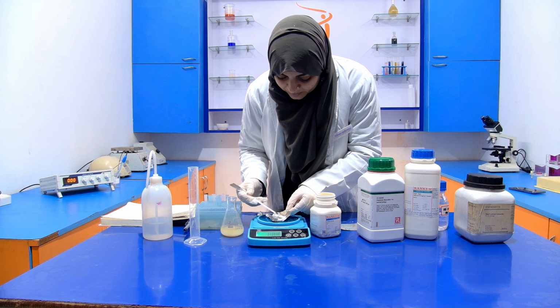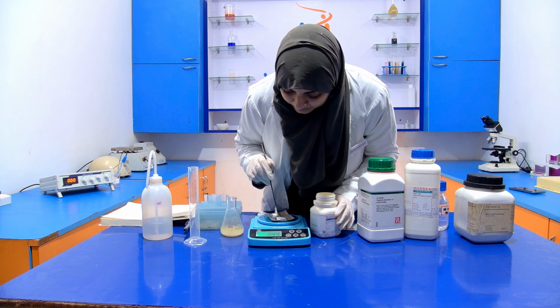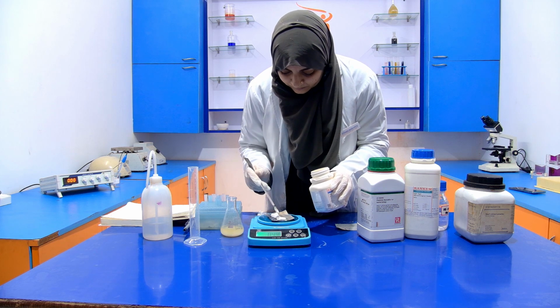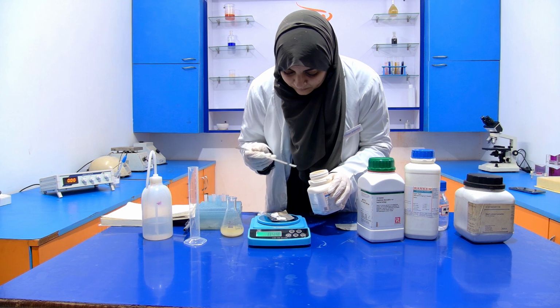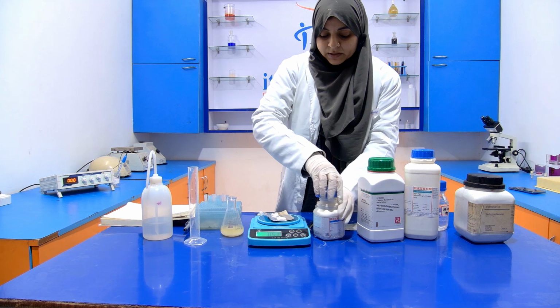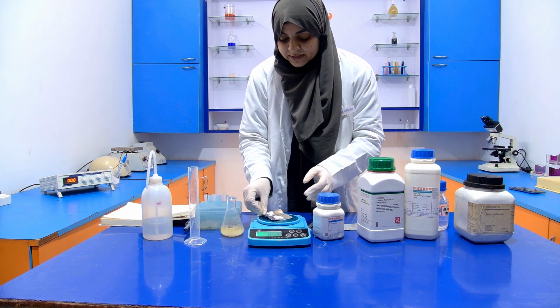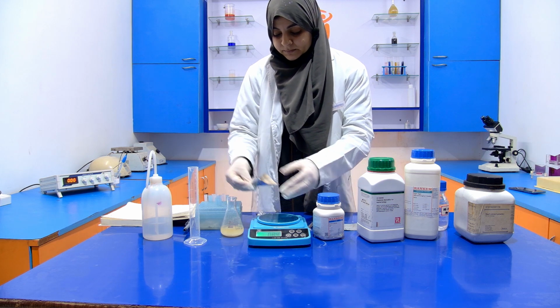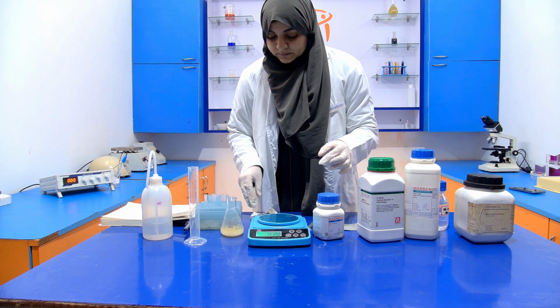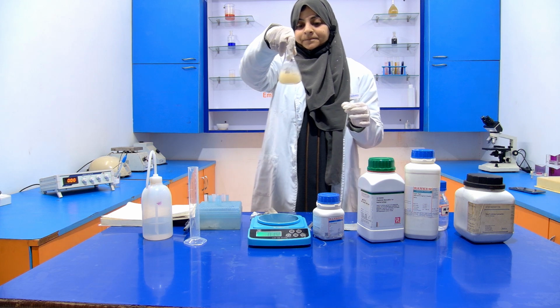That's why we have to add very carefully. Now it is 0.5. Now the sodium chloride is also added into this solution. Again we have to dissolve it completely.